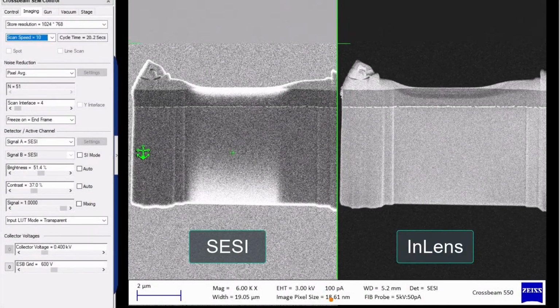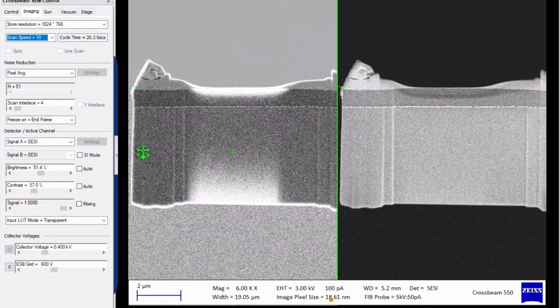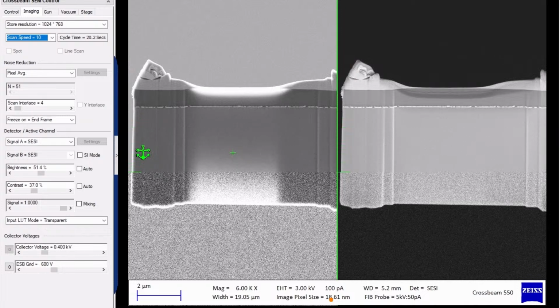That's why I said I was keeping track of that while I was thinning it, to make sure that it didn't impact any of the features that are on the surface. But so far, it's looking nice. It's thin, it's considerably thinner than it was.